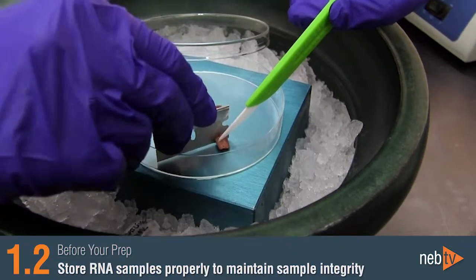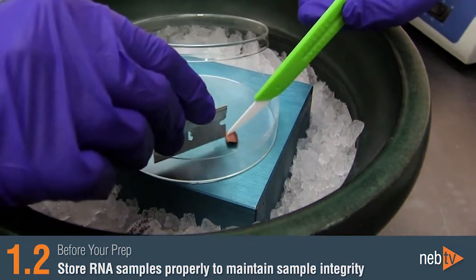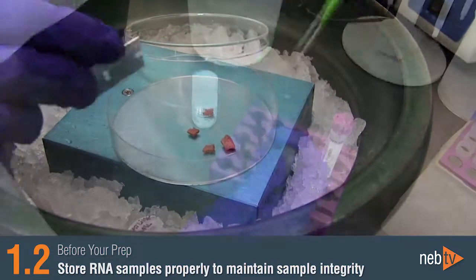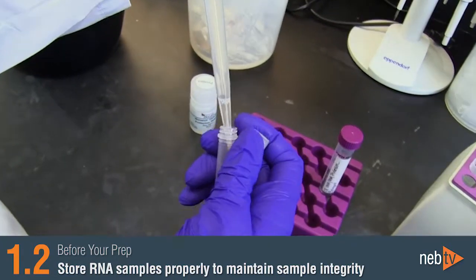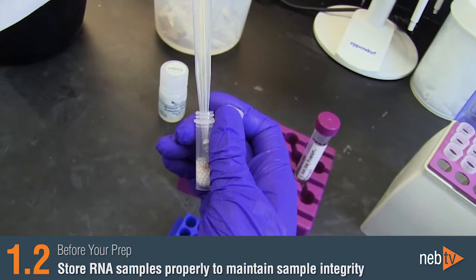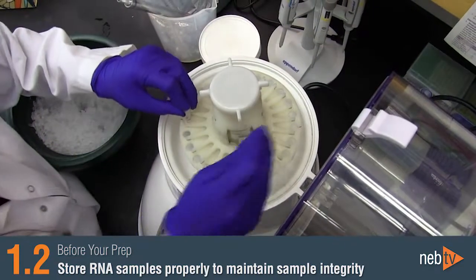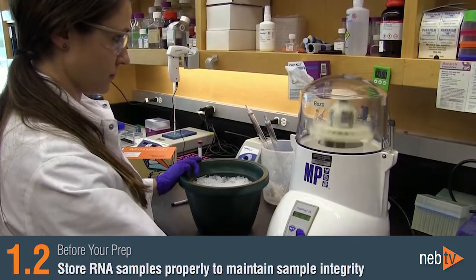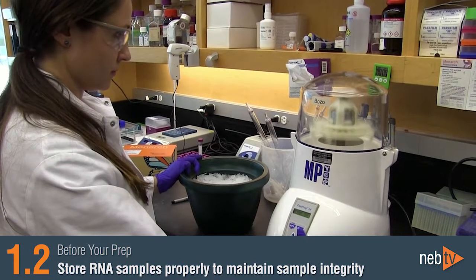Small pieces of tissue less than 20 milligrams may be stored directly in the protection reagent. However, larger tissue samples should be homogenized in protection reagent prior to storage. If samples have been preserved in the protection reagent, do not remove the liquid prior to processing, as the protection reagent also begins the lysis of the sample.